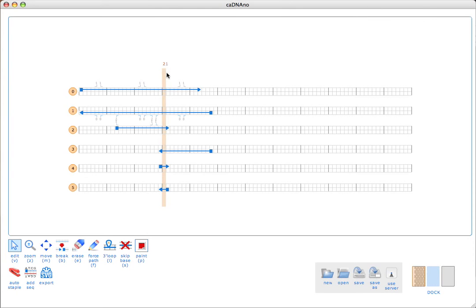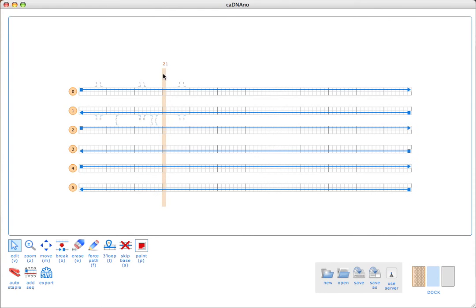I can shift-option-click on the slice bar and that will send all the breakpoints to their extreme boundaries. That's actually probably the fastest way to quickly move everything to the edges. The next step is to install scaffold crossovers between neighboring helices.